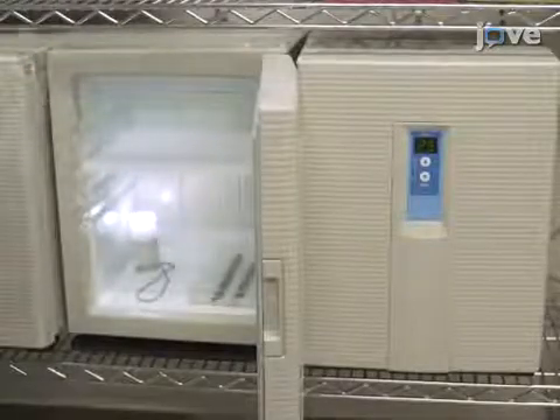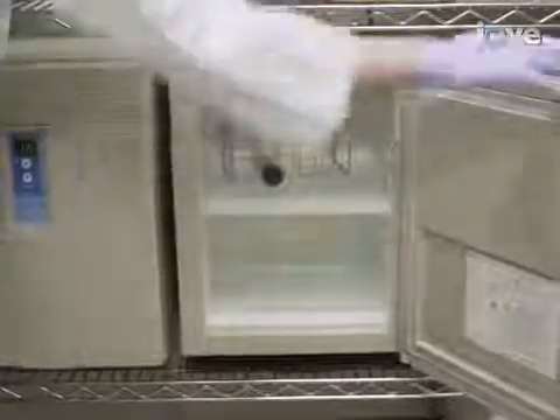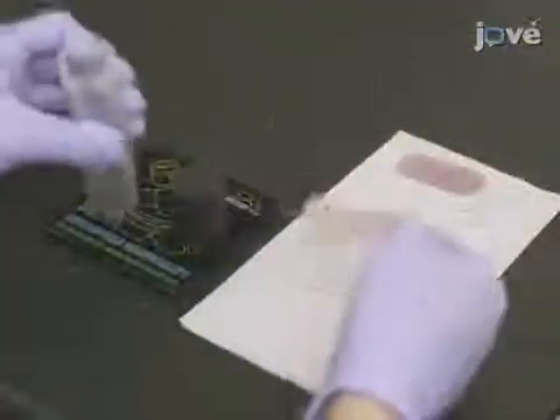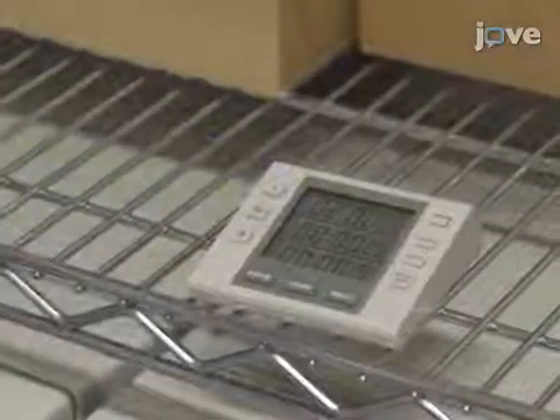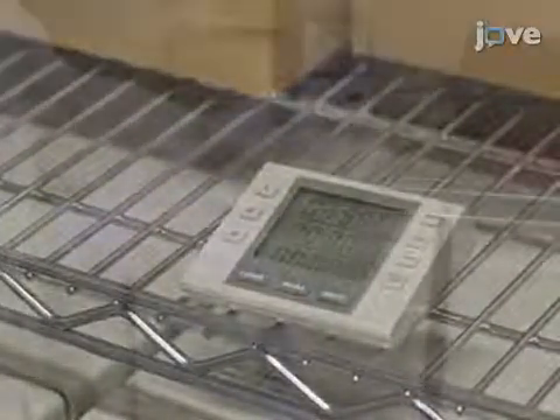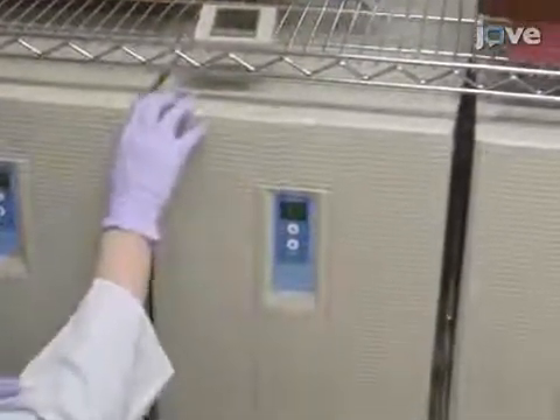At the end of the incubation, move the flies to 25 degrees Celsius in the dark for 1 hour and replace the old plate with a new plate without yeast. Allow the flies to lay eggs for 2 hours. Then incubate the plate at 16 degrees Celsius for 26 hours.